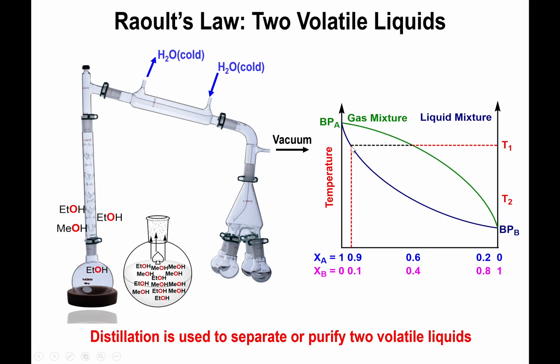Now, wherever this vertical line touches the lower boundary, you can look at the temperature and say, okay, that's the temperature, the initial temperature of the initial mixture that evaporated. But here is the deal. The evaporate has entered this column, and you might notice that this column has these spikes that point downwards. Those spikes serve as condensation points. They're cool enough and they don't heat up easily, so they remain cool enough to recondense that vapor you just created. But at the same time, you don't change the temperature a whole lot.